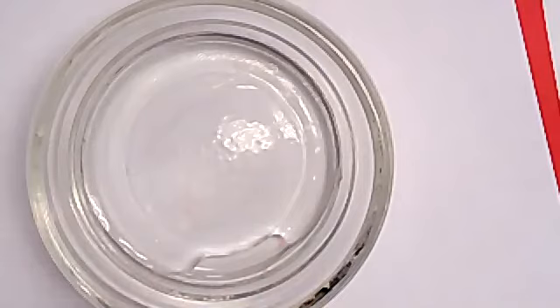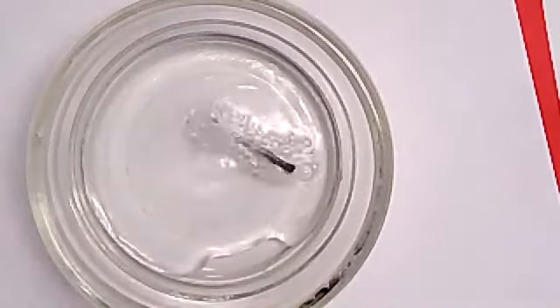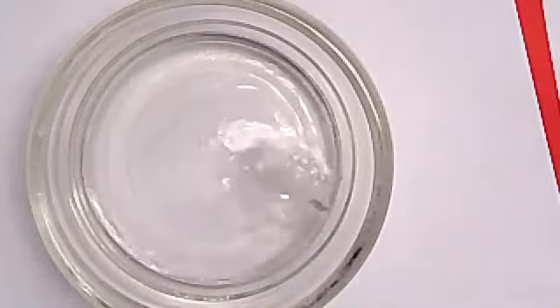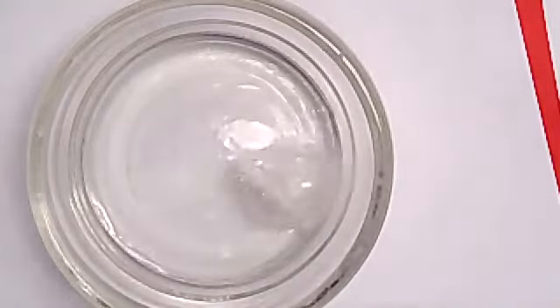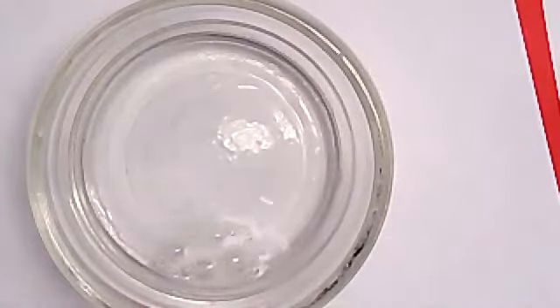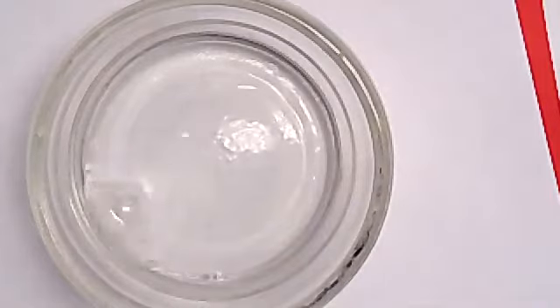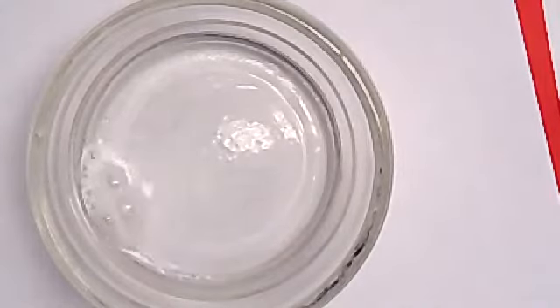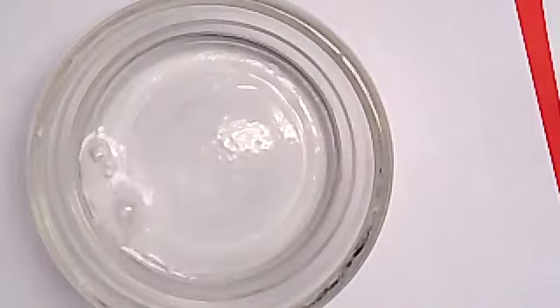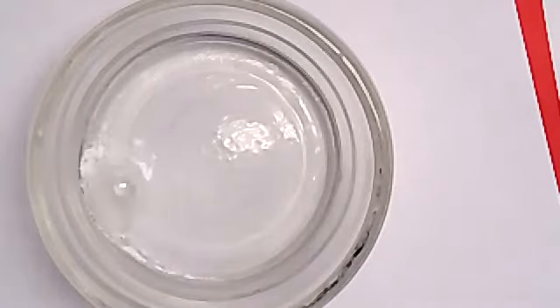All right, so I'm going to go ahead and add the magnesium into the acid. As you can see, a very vigorous bubbling going on here. And hydrogen gas is actually being produced from this reaction. So go ahead and write down either chemical or physical. And write your justification as that continues to bubble.